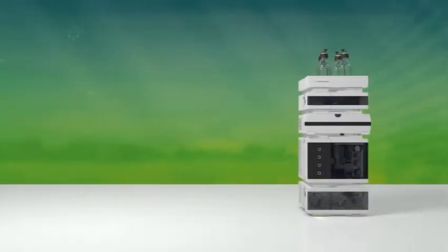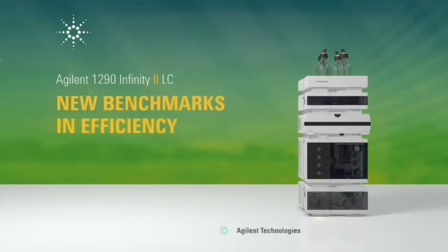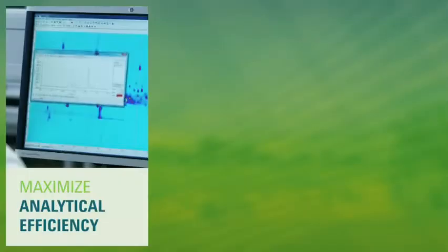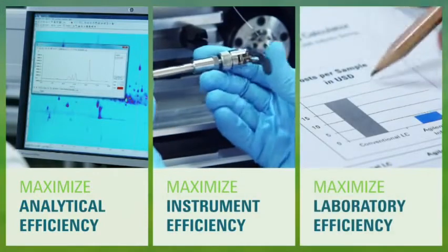The Agilent 1290 Infinity 2 LC system embodies the next generation of UHP-LC, setting new benchmarks in analytical, instrument, and laboratory efficiency.